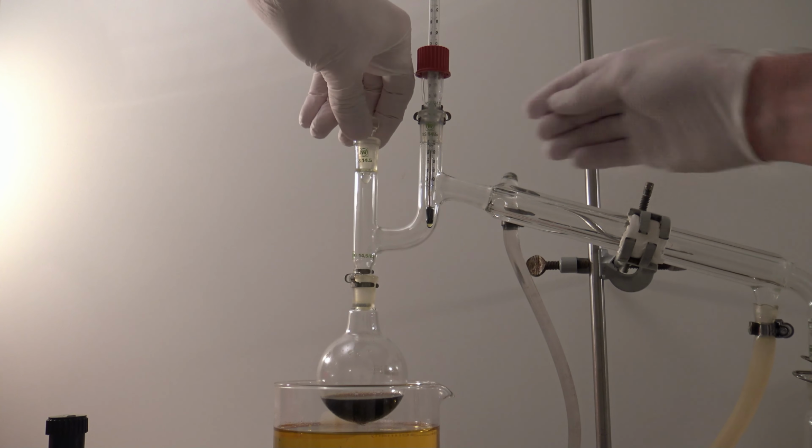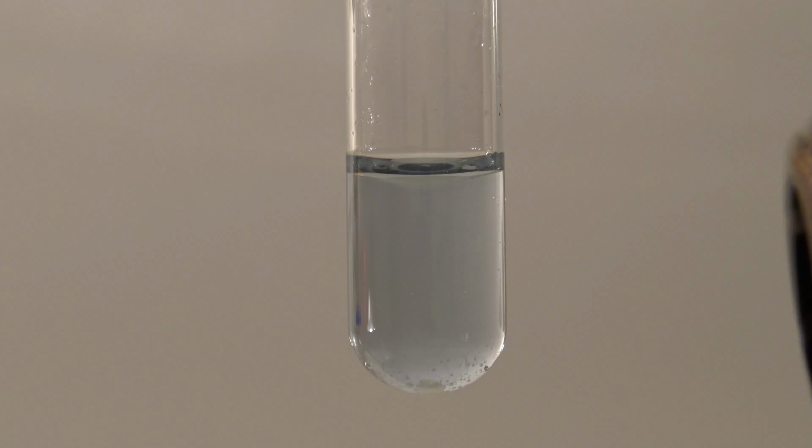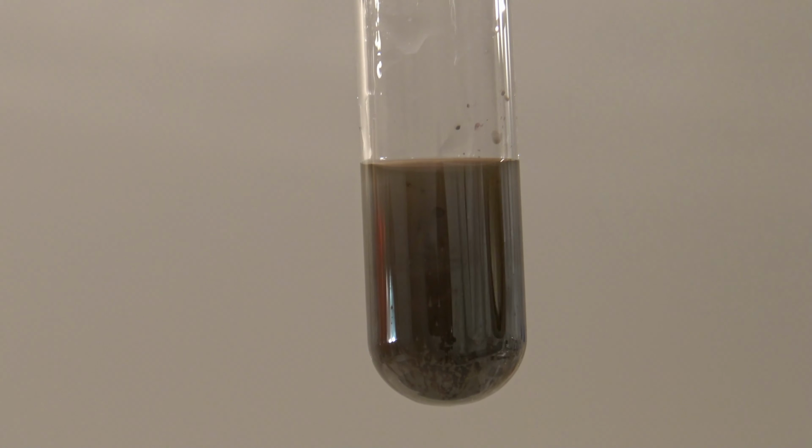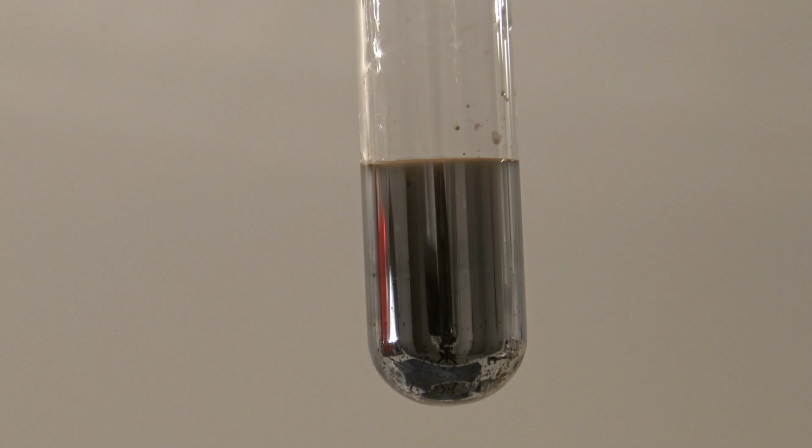Bromine water is used to test for double bonds, but in this case it could also be reacted by the aldehyde group. Obviously, a reaction took place. Next, the Tollens reagent was used to test specifically for the aldehyde group. The sample was added to a solution of silver nitrate and ammonia and heated up. If the test is positive, the silver ions are reduced, leading to a silver mirror, as it can be seen here.